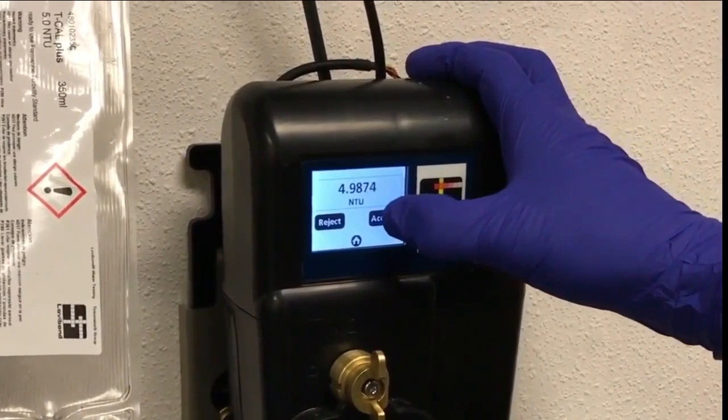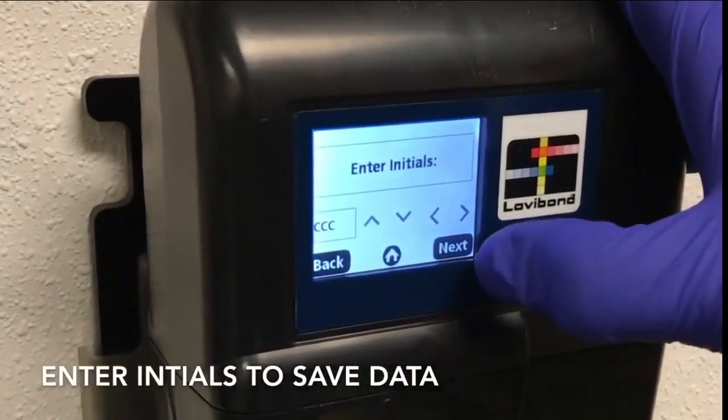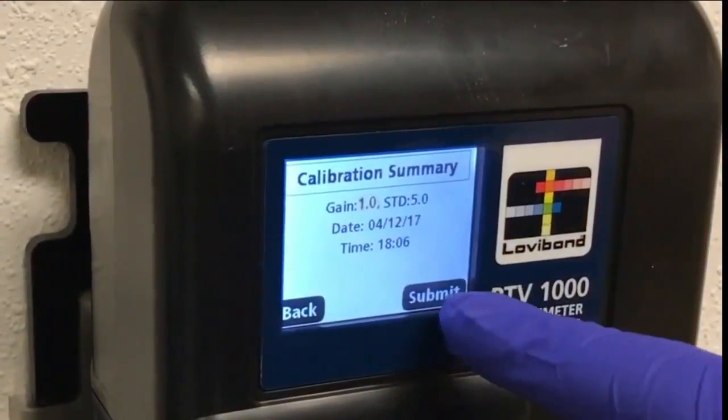Hit Accept once the outputs have stabilized. This will save the data and prompt the entry of the user's initials. Once entered, a calibration summary is presented for preview. You can submit this summary by pressing Submit.